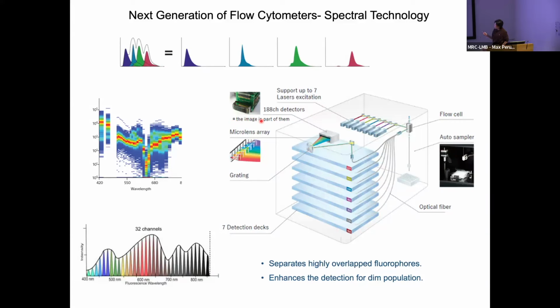So rather than collecting only a band of the emission light, spectral analyzers utilize light diffraction grating technology.